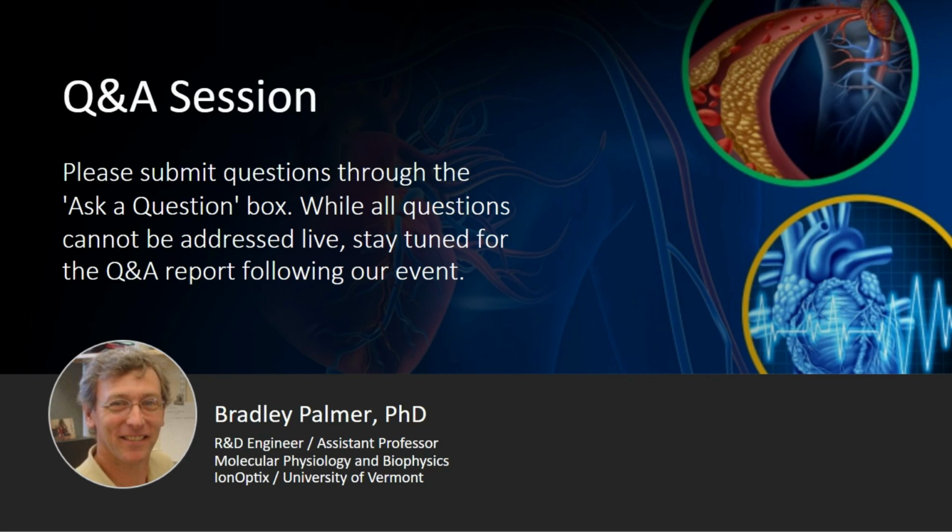We don't take into account any possible discontinuities in the thickness or the width, because we so far just haven't been able to observe it. We just haven't been able to observe a significant amount of discontinuity. Okay, hopefully that answers your question, Teresa.